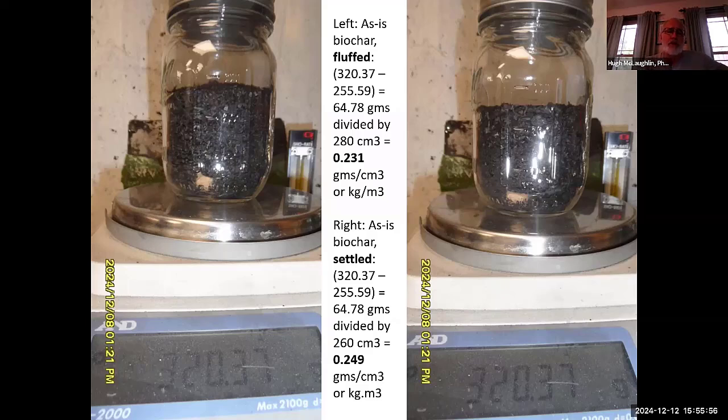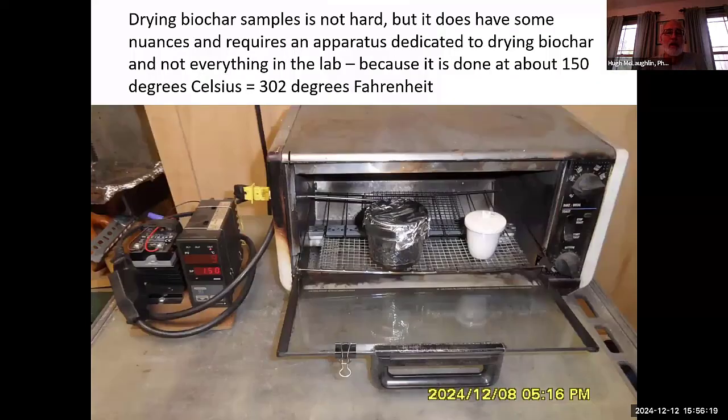And if you're going to be using biochar, if you're going to be making decisions based on the input, you need to have a modicum of scientific method and equipment, of which apparently canning jars and low cost scales are part of the game.